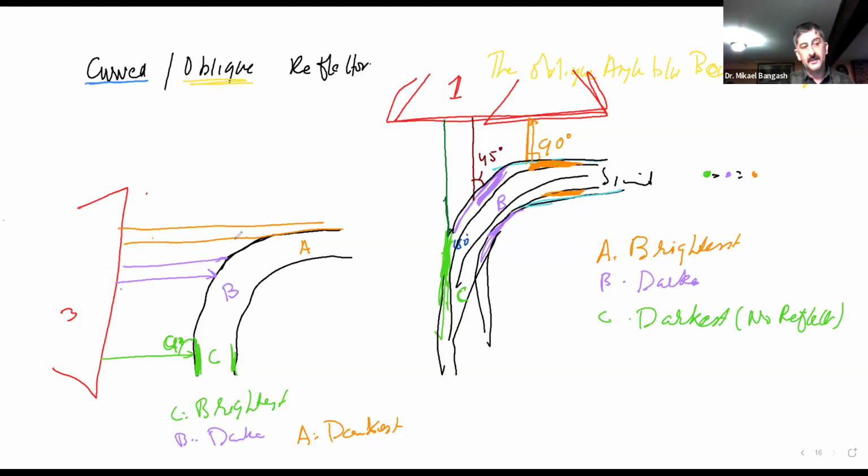So that mainly confirms that this change in the intensity of your reflections was really not due to a changing composition or buildup of the structure as we went from one area to another, but mainly just artifacts produced by us going from an ideal angle to a not so ideal angle and not an ideal angle at all. Did you guys get that?